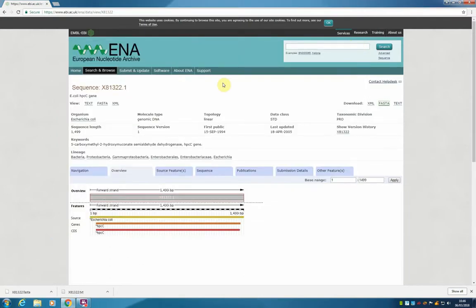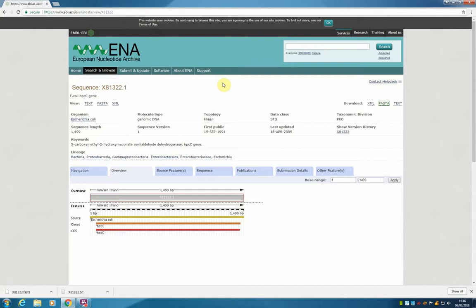In this demonstration, we have shown you how to search for a gene entry using NCBI and ENA, as well as to download the sequences into your computer. If you have any comments, please leave them on the comment section below the activity. We hope you've enjoyed this demonstration and hope to hear from you soon.